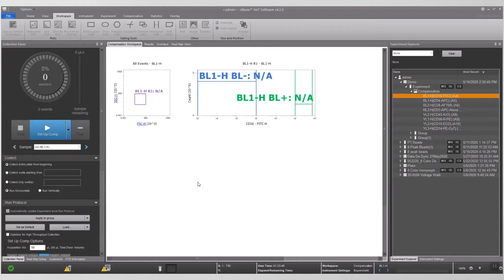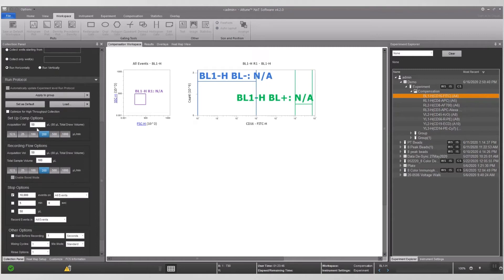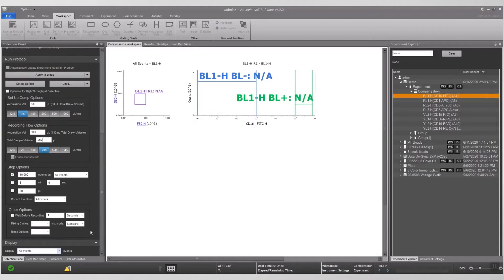To change the run protocol, go to the control panel tab. To adjust the voltages, change the setup mode run protocol to a flow rate of 25 microliters per minute to avoid using all of the sample. Adjust the run protocol for recording plates by changing the volume and flow rate. Note that the total volume must add up to the total draw volume for setup and run. Change the wait before recording.